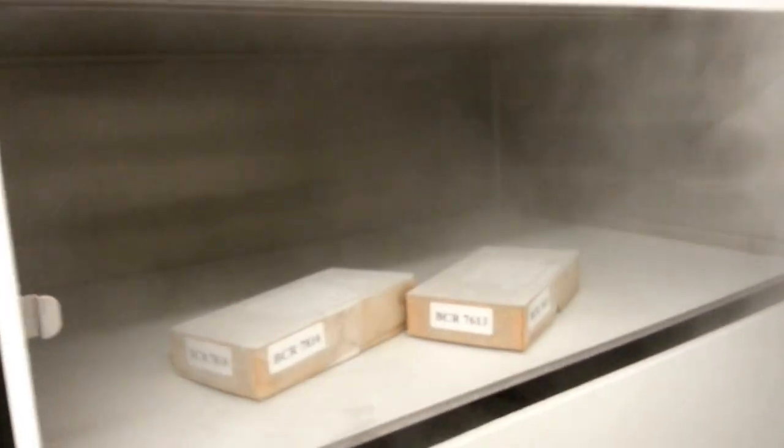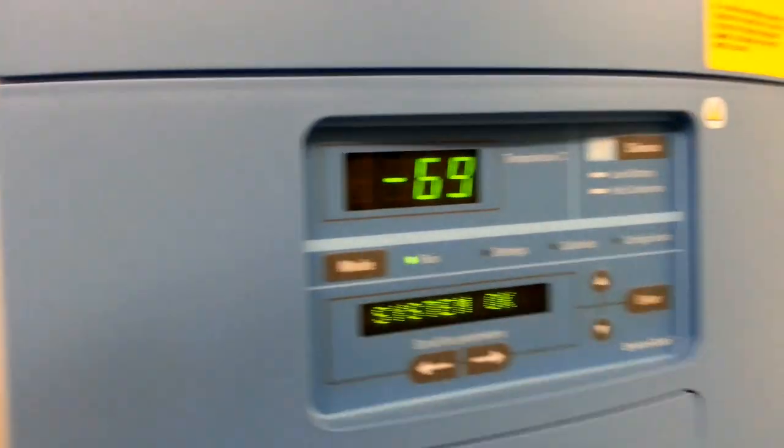This is the inside of the minus 70. You can see it's pretty cold. I've got a sensor down here that measures the RTD sensor temperature. And you've got a filter rack down there to use it, and there's your controller.